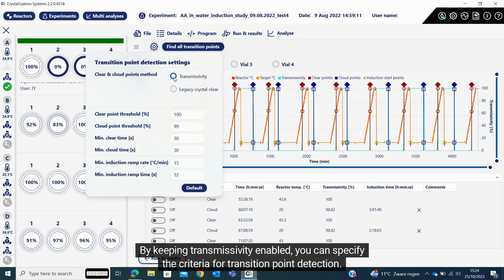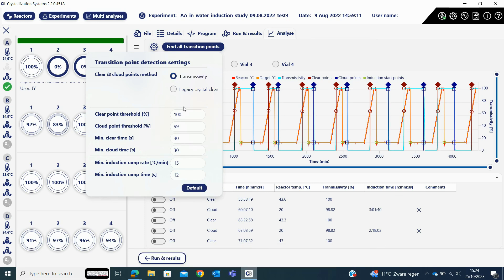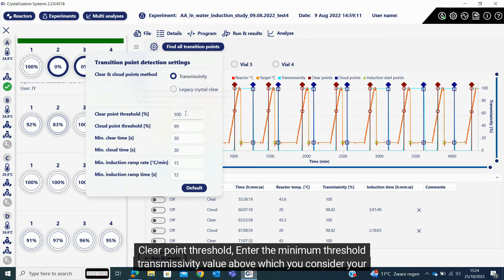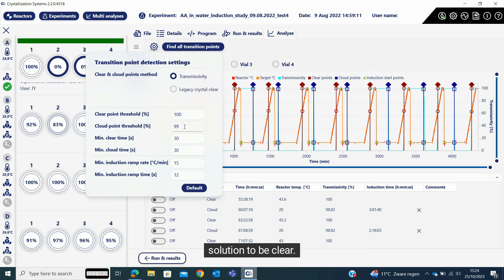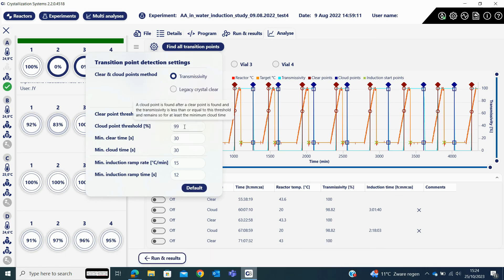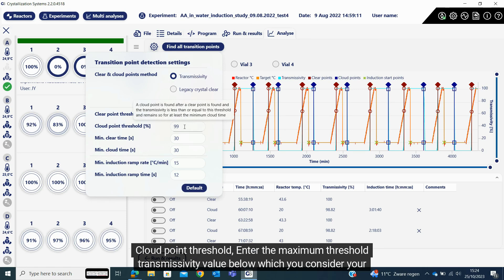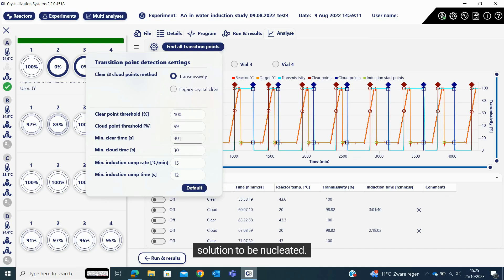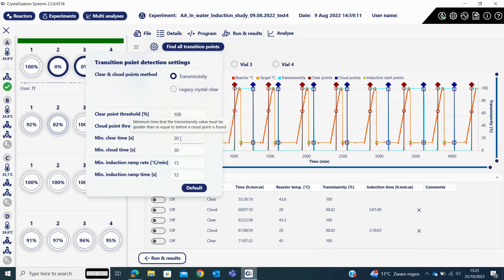By keeping transmissivity enabled, you can specify the criteria for transition point detection. Clear point threshold: enter the minimum threshold transmissivity value above which you consider your solution to be clear. Cloud point threshold: enter the maximum threshold transmissivity value below which you consider your solution to be nucleated.